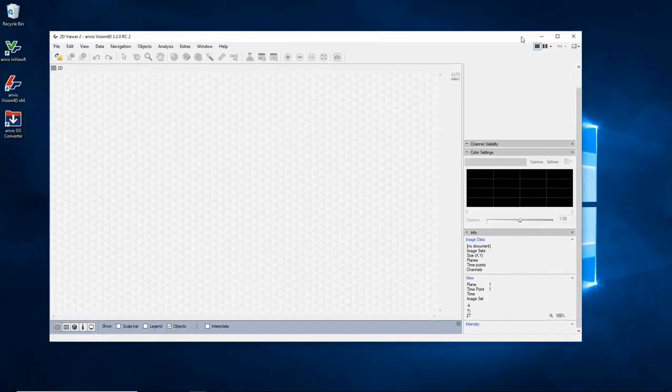So we try not to make anything too radical because obviously we have so many of you users who've been using the software for a while now, and we don't want to be confusing everyone. So at first glance, everything will be very, very similar. But it's really when you start going into the new pipeline operations that you'll see some significant changes.